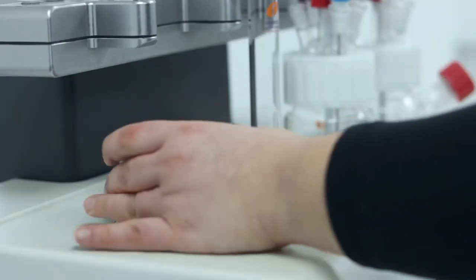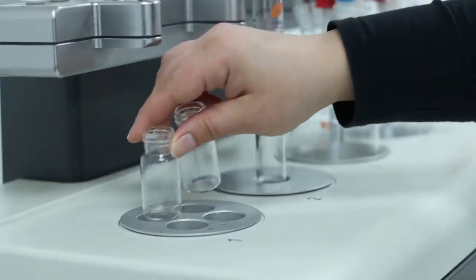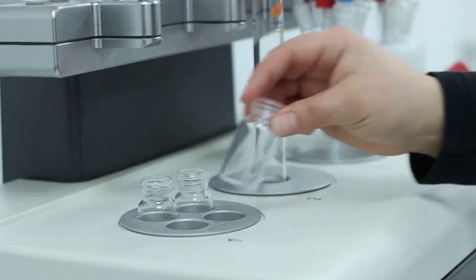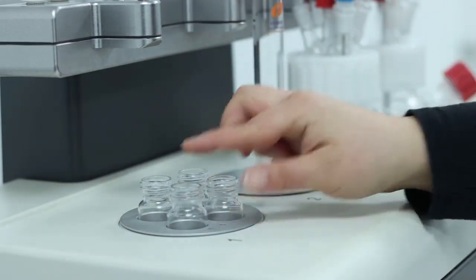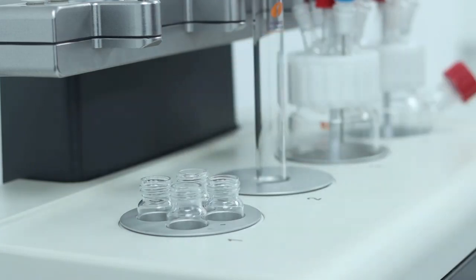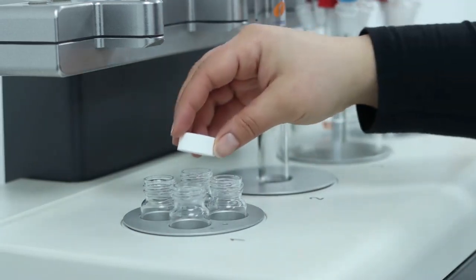To use a certain type of vial, pick the right insert and drop it in one of the zones of your Maia 4, then place the required number of vials in the insert. Add the recommended stirrer bars and caps if using.